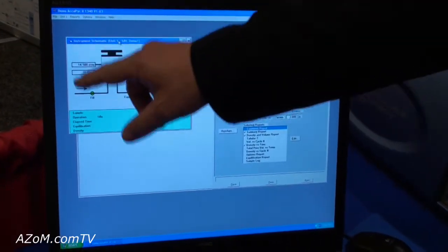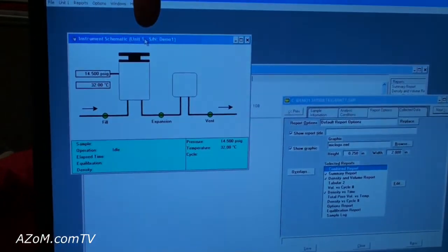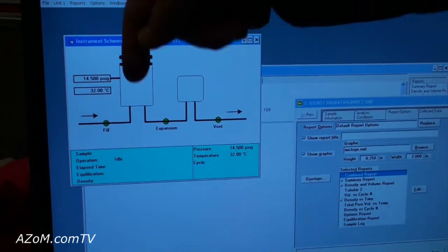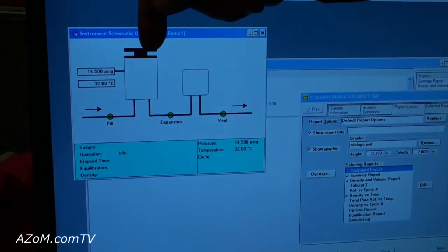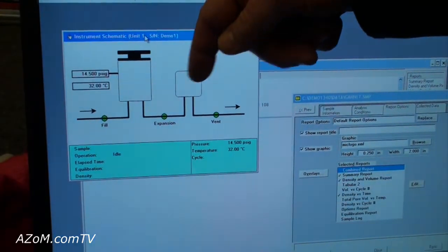Just to show you a little bit of how the instrument is designed, this is a schematic representation of what you saw previously looking at the instrument. This is the sample chamber with a cap for it and what is called an expansion chamber.